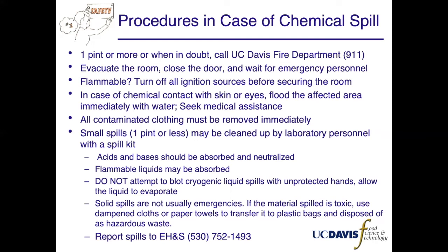In case of chemical contact with skin or eyes, flood the affected area immediately with water and seek medical assistance. Remove all contaminated clothing. Do not be concerned with modesty in the event of a chemical spill. Some labs will also keep spare clothing for this purpose.